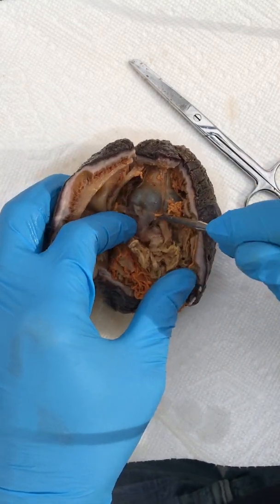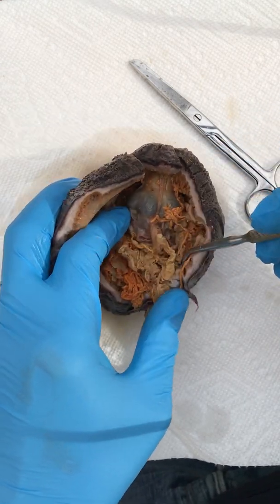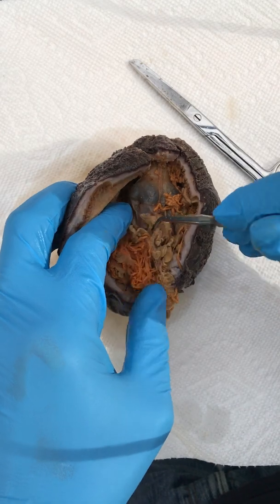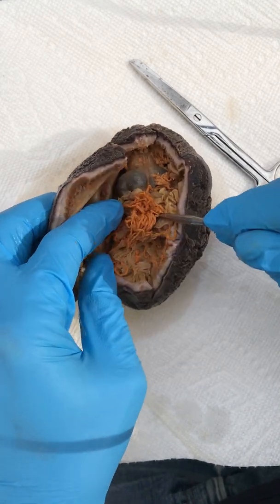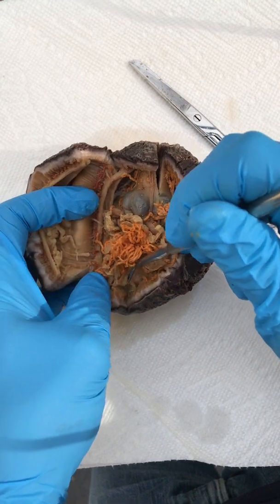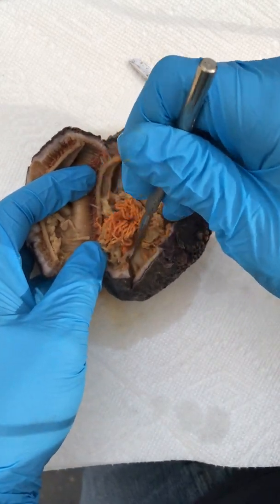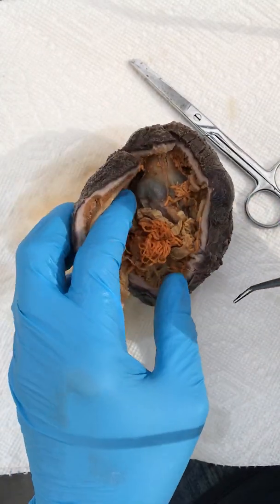After the stomach you have the remainder of the GI tract. The intestine is highly coiled and wound around here. Then it finally exits at the end through the cloaca. I did slice through a little at the end of the intestine — it would come down and exit out through the anus there.